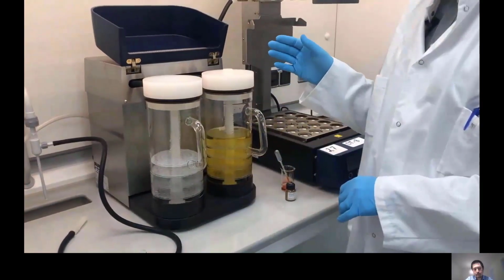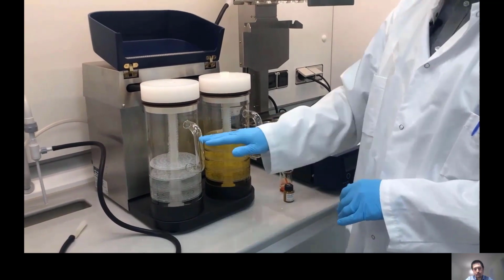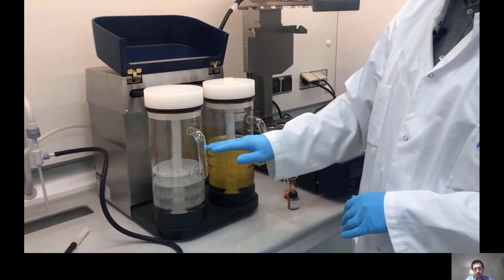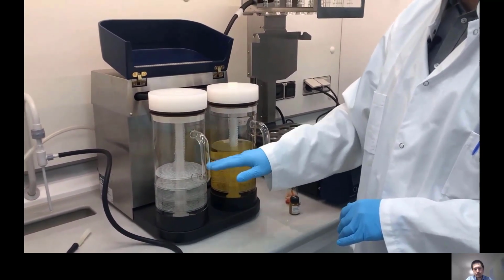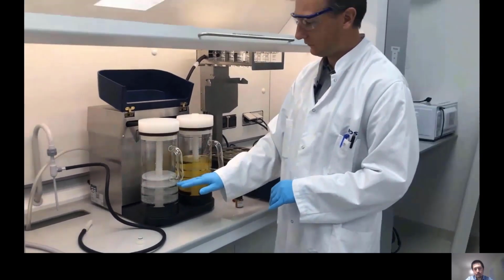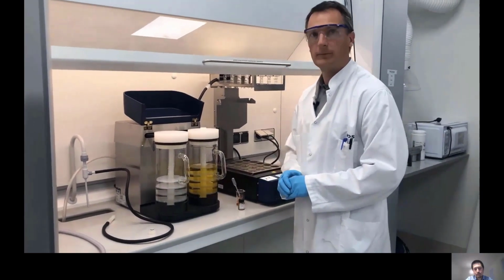When you have taken out all the liquid, you need to refill it again to this level here, for both solutions, the alkaline and the water. And if you have a lot of moisture or water in the samples, then you need to have approximately this level for the water.